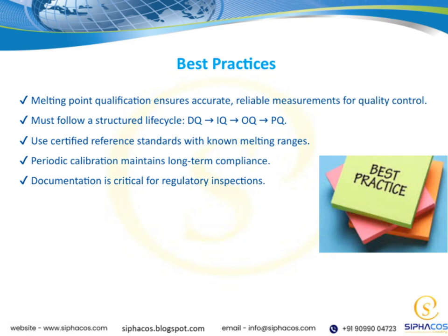Using certified reference standards with known melting ranges is also key. These standards serve as benchmarks, ensuring our equipment and procedures are working correctly. Periodic calibration is another important step. Regular calibration helps us maintain long-term compliance with regulatory requirements and keeps our measurements trustworthy over time.